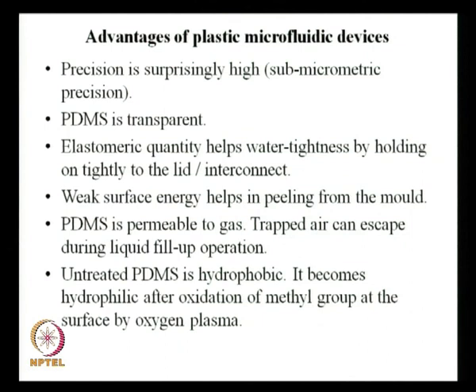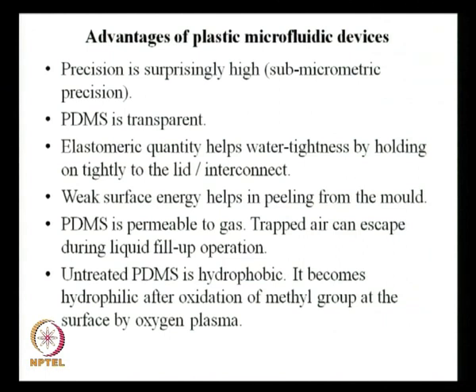The other point is untreated PDMS is hydrophobic. Hydrophobic means if you want to flow water through a PDMS channel, you will find resistance. If you had taken an inert channel of similar size, it would be easier for the liquid to flow through the channel, but since it is hydrophobic, to flow water through that channel you have to overcome a higher pressure drop. That may not be good for your application, or it may be good, you never know. It depends on what application you choose.